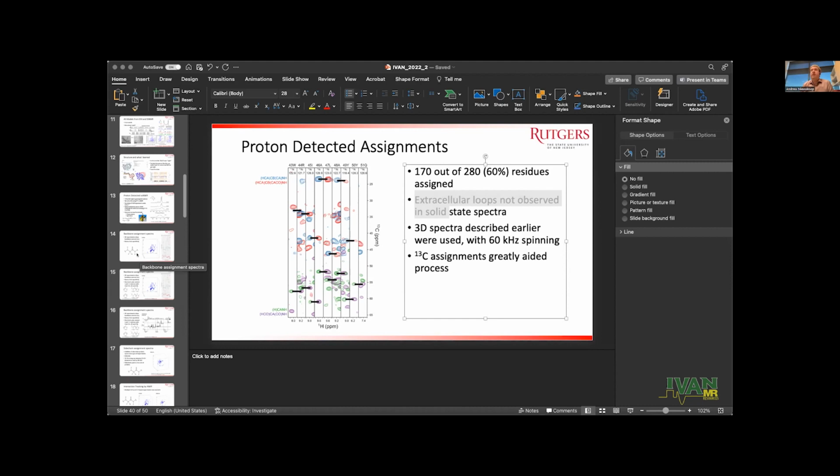We've been using zirconia for a very long time because it's very strong, but we're starting to get to the point with those 0.4s that most of that 0.4 rotor is wall at this point, as opposed to the hole in the middle of it. And so people are beginning to think again if there are other materials that would be helpful. The very first rotors were stainless steel, and we've gone away from that, but you know, all these cool materials, you find something that's non-ferrous that you could spin in a magnetic field that's got a better tensile strength. I don't know, diamonds have been bandied about. Yeah, every time people think we're not going to be able to go any faster, 5 years later somebody spins a rotor a little quicker.